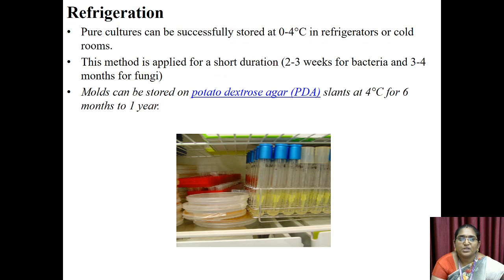Next, refrigeration. Pure cultures can be successfully stored at 0 to 4 degrees Celsius in refrigerators or cold rooms. This method is applied for a short duration, 2 to 3 weeks for bacteria and 3 to 4 months for fungi. Molds can be stored on potato dextrose agar slants at 4 degrees Celsius for 6 months to 1 year.